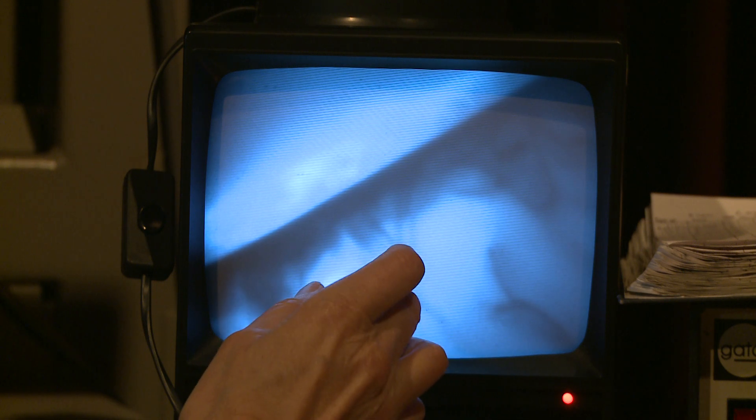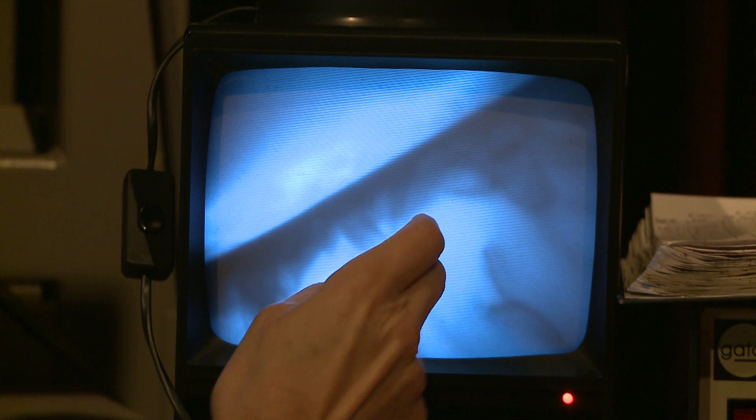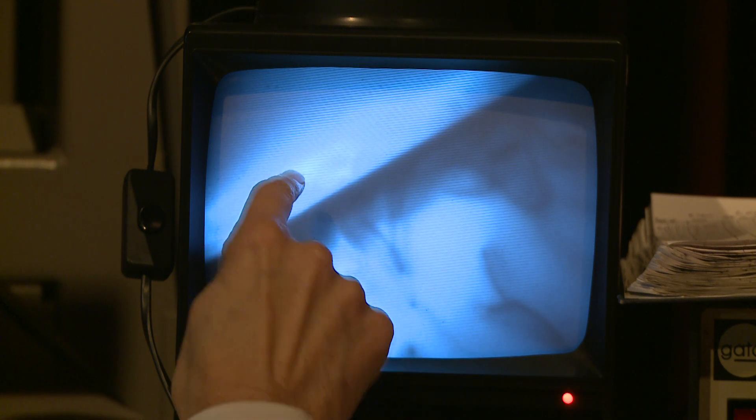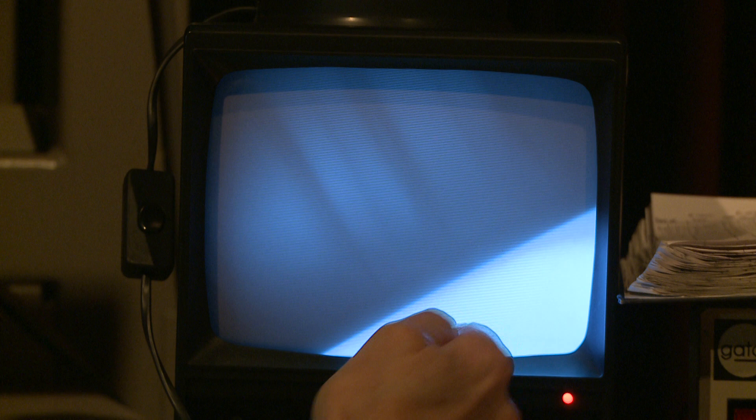What we're looking at here is a piece of LED in the electron microscope. The LED is gallium nitride grown on sapphire — like any commercial LED you buy. This is sapphire down here, and this is the gallium nitride grown on it. These lines are dislocations — defects in the crystal structure. Moving across, we see other straight lines called stacking faults, which are different sorts of defects. It's important to understand their distribution in the material. Following the dislocations down through the material, we can see the quantum wells, which are where the light is emitted from, just near this interface at the edge of the specimen.